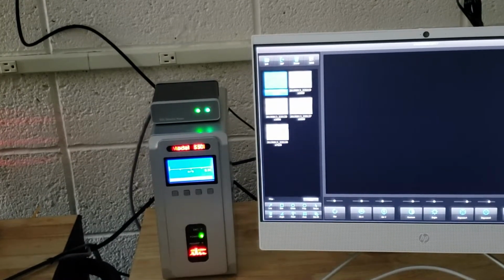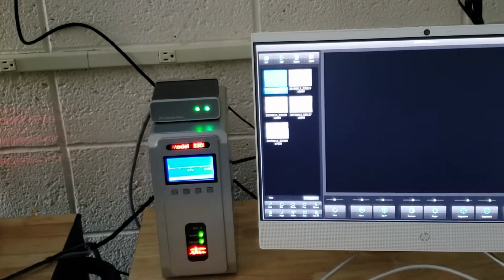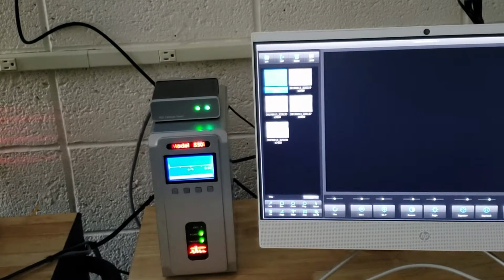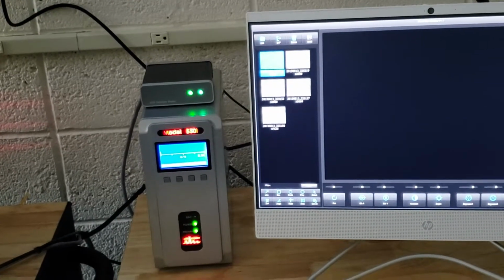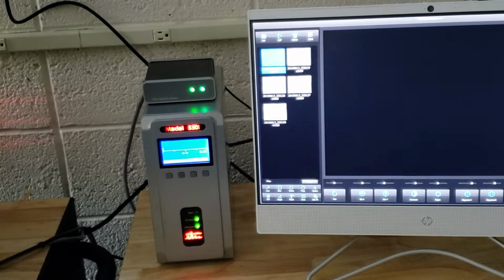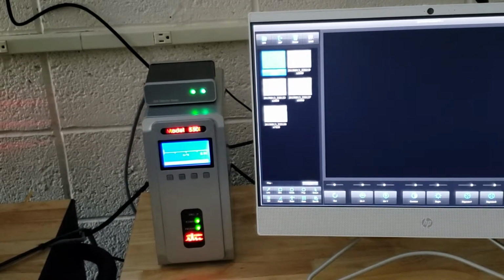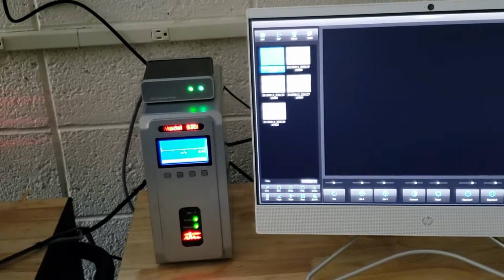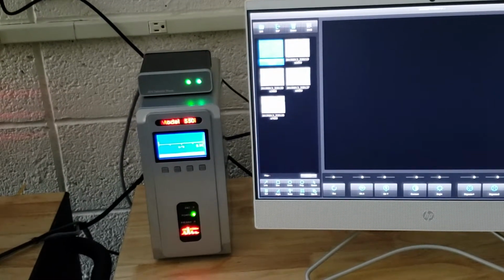me up and say, hey, Jim, this is going on. I might say, hey, Carl, can you go to the IXRF Analyzer, hit the menu button really quick, go to the oscilloscope, hit enter, and just hold the start button down for me? What do you see? And you're like, I see a 10 volt steady line. Okay, that's not good. Detector's blown. Anyway, it's troubleshooting for me. Your interaction, again, is really nothing there. But it's there, I'm explaining.